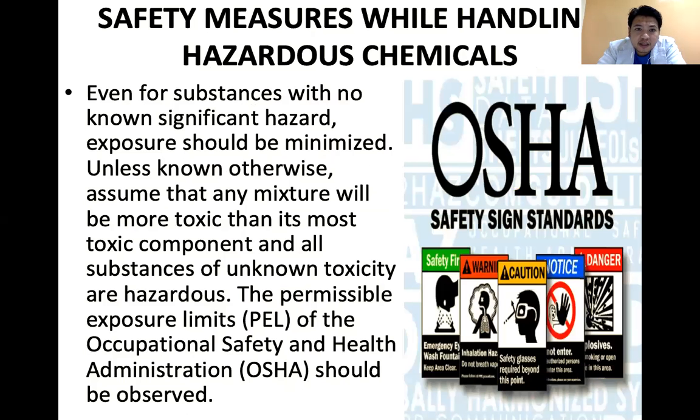So yung aming biosafety seminar before training and seminar is being conducted by the OSHA or Occupational Safety and Health Administration. So safety measures while handling hazardous chemicals. So even for substances with no known significant hazard, exposure should be minimized unless known otherwise.